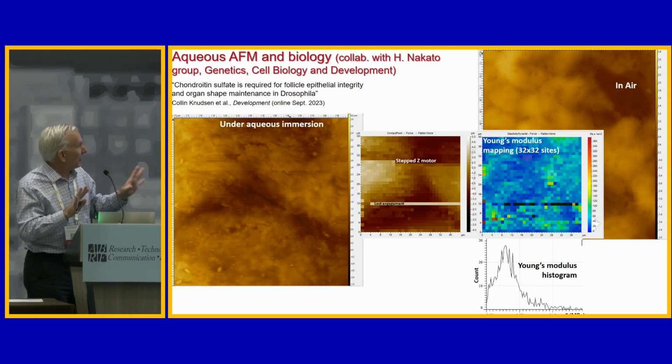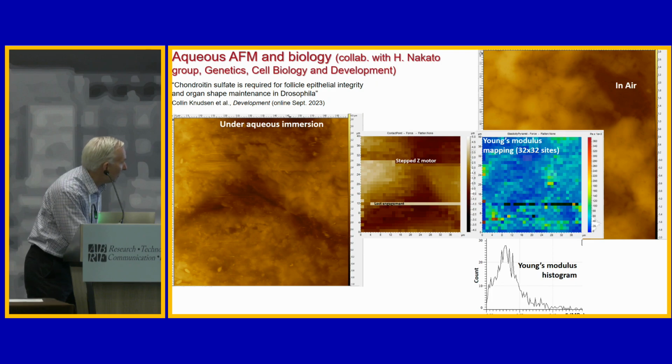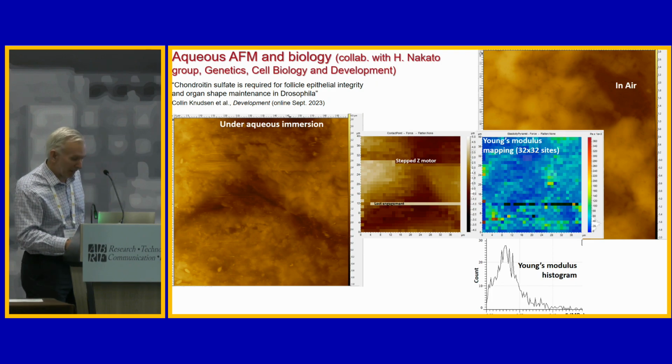I actually gave part of this in an AFM audience talk, and so I talked more about issues with our data processing. But anyway, you get a sense of the size of the Young's moduli that we're measuring here. Way down in the, I guess, tens of kilopascal.